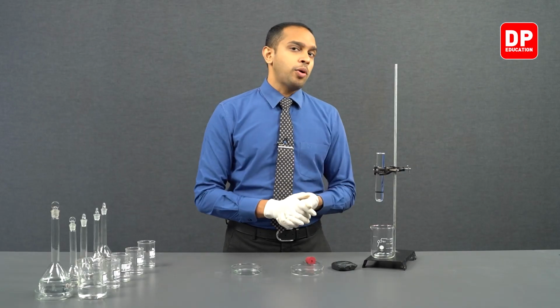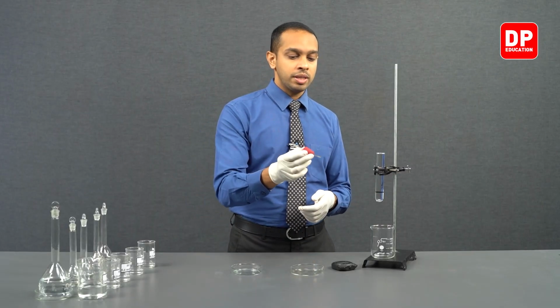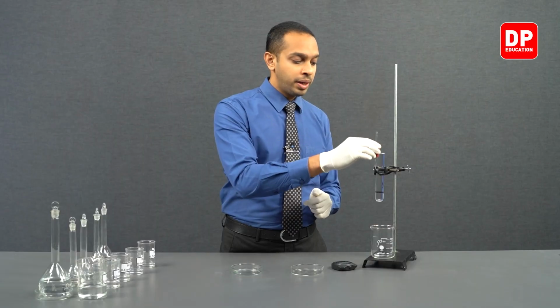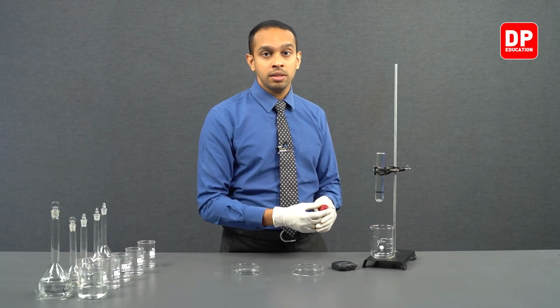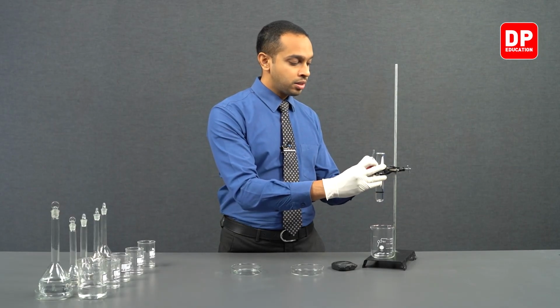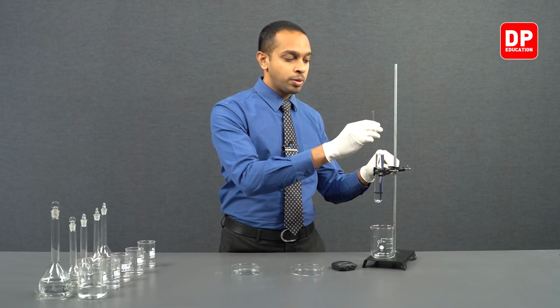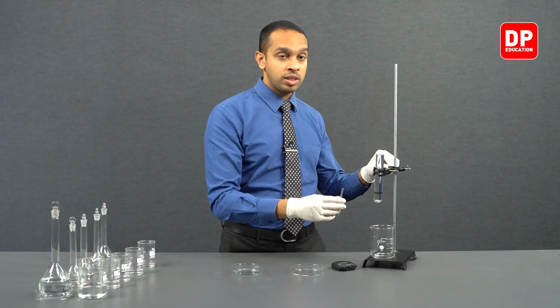After filling the boiling tube all the way to the top with our HCl solution, we can take our rubber stopper along with the magnesium strip and we can place it and start our stopwatch after turning the boiling tube upside down. So let's get ready to do that. We will be placing this rubber stopper and starting the stopwatch soon after we turn it upside down.